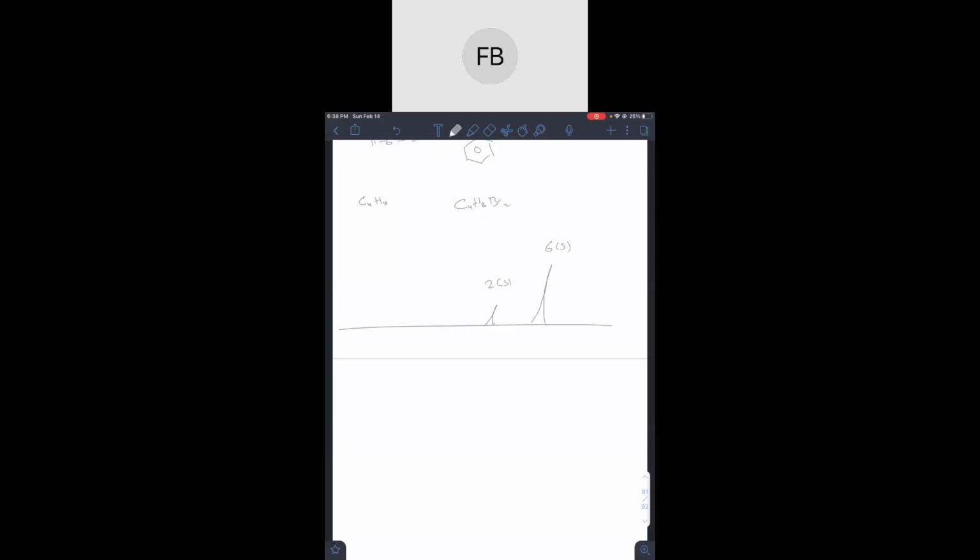Okay. So now we know that there's no double bonds or any rings. So that could look a few different ways. It could look like this. It could also look like this, right? I think those are the only two options. All right. So going off of that, what are you thinking now? This one's actually a little bit complicated. I'm thinking it's going to be the second one. The second one, okay.